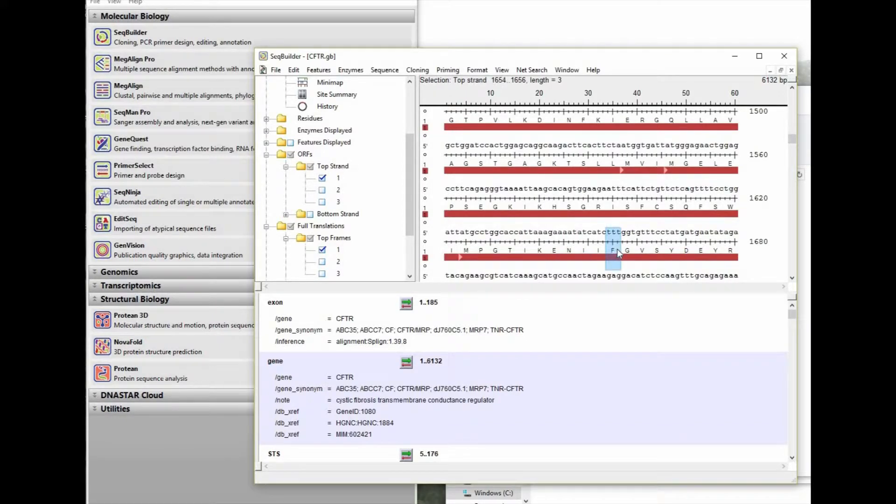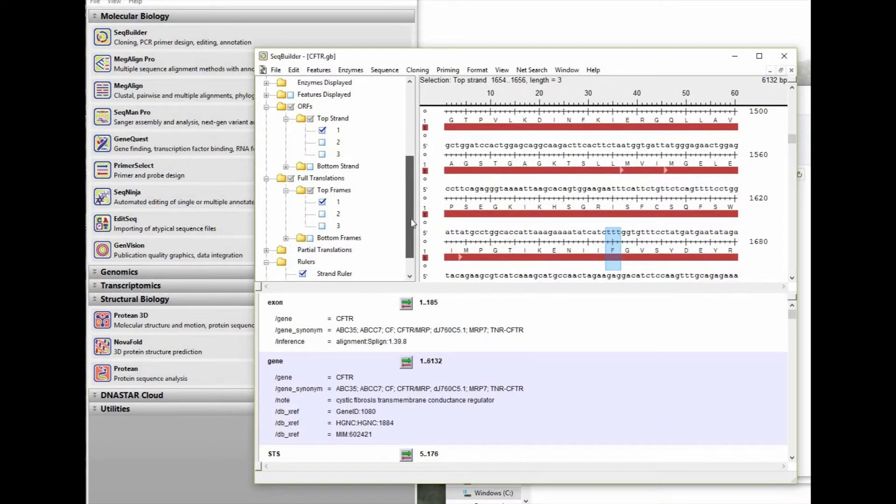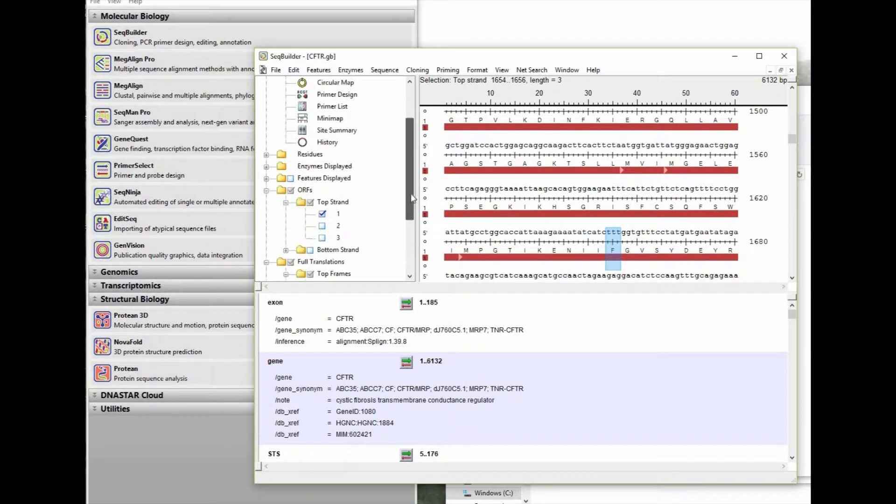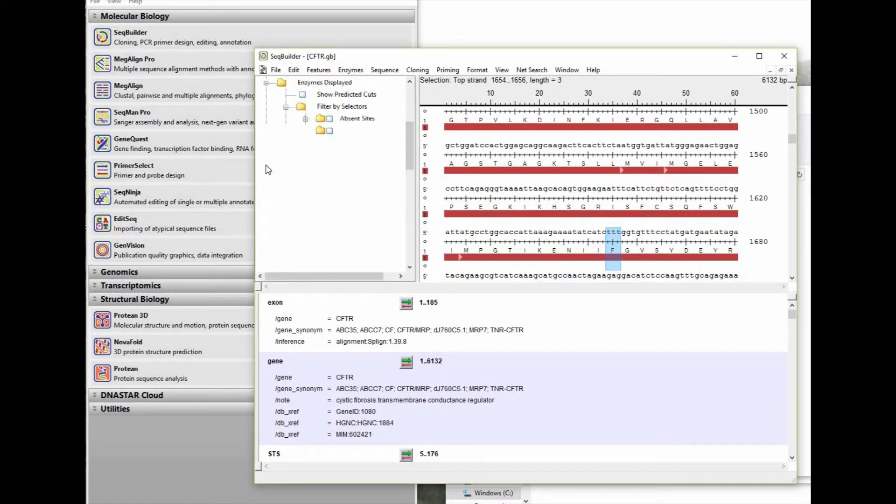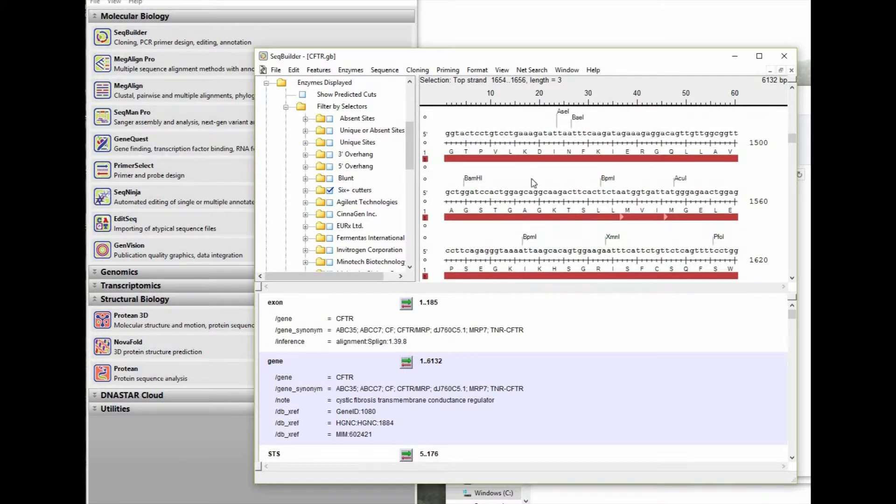We've also identified some of the neighboring sequence so that we can quickly find the positions that encode the del 508 site. So as we scroll down, we start to find the right neighborhood, and here we find the phenylalanine at position 508. So now we're going to add to our display restriction enzymes that target sites of six or more base pairs.